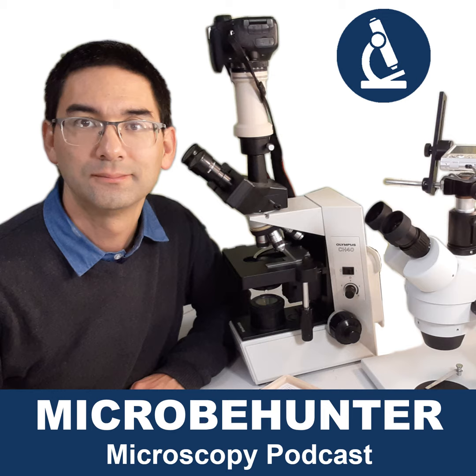So especially for fast-moving water organisms, you want to work with a low magnification. I often use only the 10 times or 20 times objective. And if you really want to make them large, because you want to look into the organism, since many of them are transparent and you can look at the stuff going on in them, then I usually use my 40 times objective with a total magnification of 400 times. So you see, you're covered, okay?